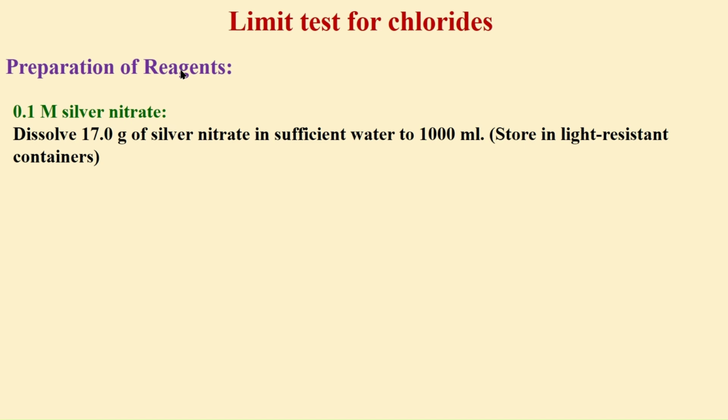Here, the silver nitrate solution should be stored in a light resistant container, that is an amber colored bottle. Otherwise, the silver nitrate gets degraded.